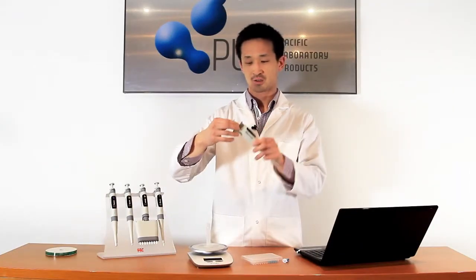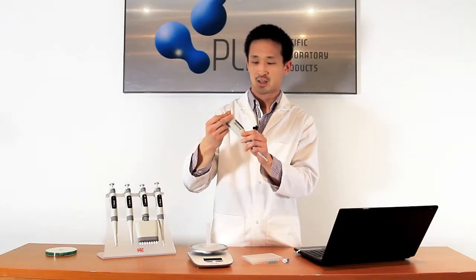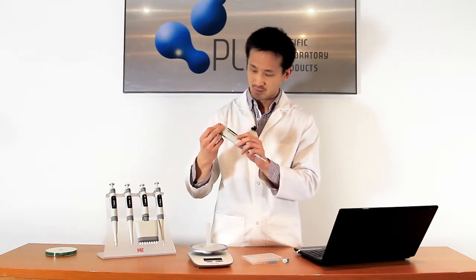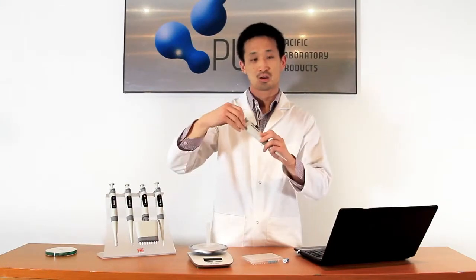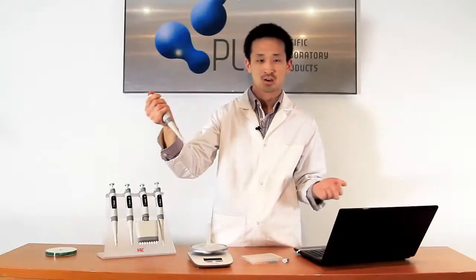The units also come with a volume lock. You pull up to change the volume, and HTL has taken into consideration the number of turns it takes — it's not really many to get down to the smallest volume. You push down to lock the volume, and if you forget, you just start using the pipette and it will lock anyway.